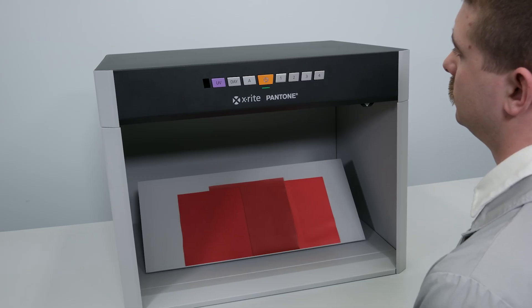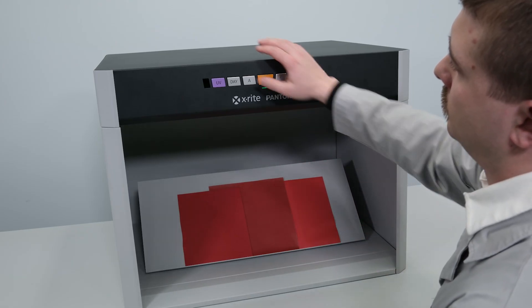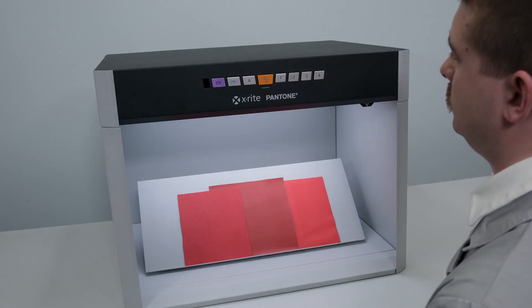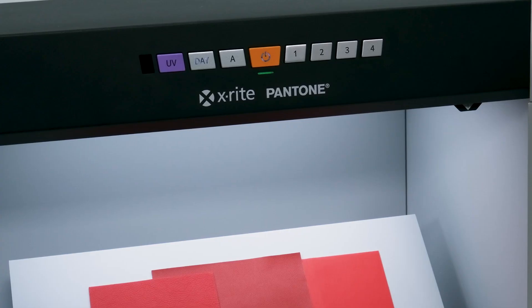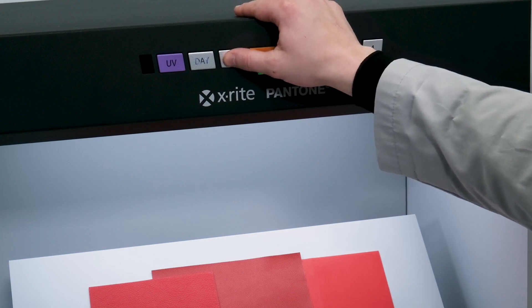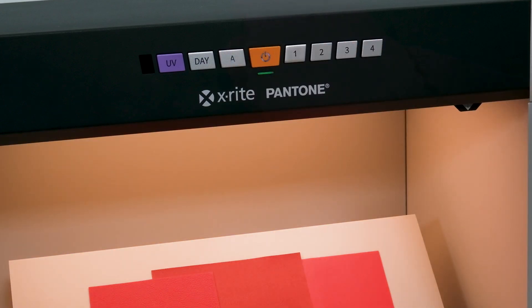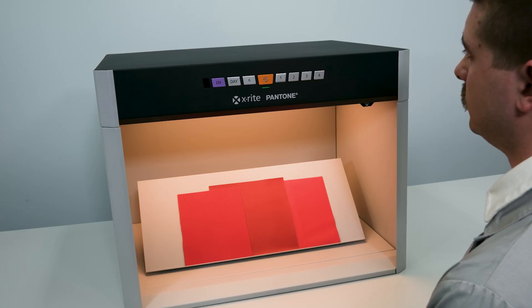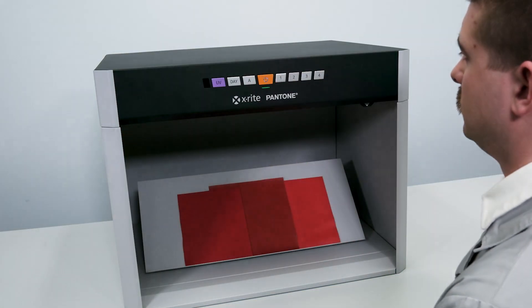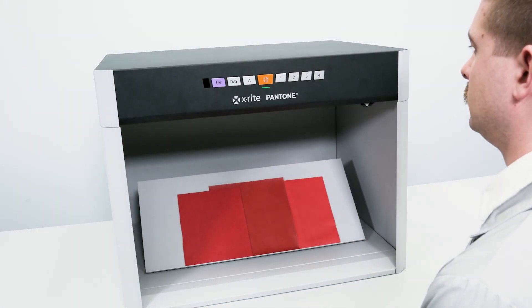To turn on an illuminant, simply press the desired button. To switch to a different illuminant, press the button for the illuminant you want to change to. The previous illuminant will automatically switch off. Push the same illuminant button again to turn it off.